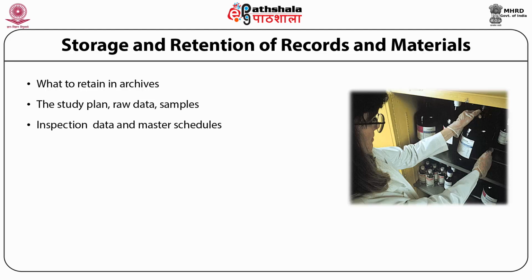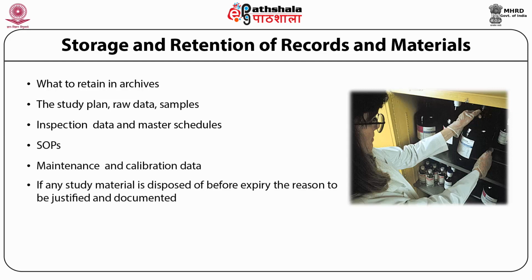inspection data and master schedules, SOPs of all the lab testing procedures, maintenance and calibration of all the data. If any study material is disposed of before expiry, the reasons should be justified and documented.